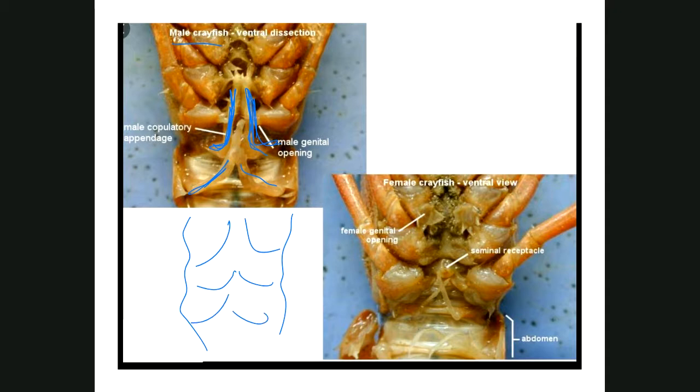And it's easier to tell the female because the female is missing that rigid structure. It's very short, flexible swimmerets. You know, see how floppy they are? And it has a little opening here, which is the seminal receptacle. It's what accepts the sperm packets from the male.